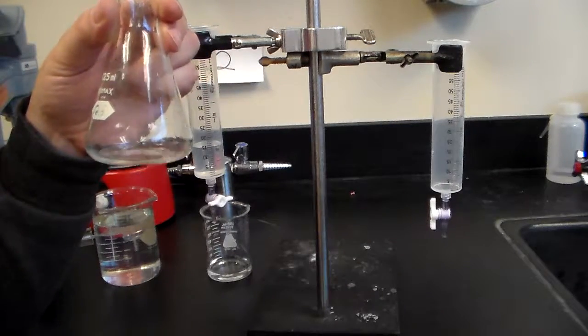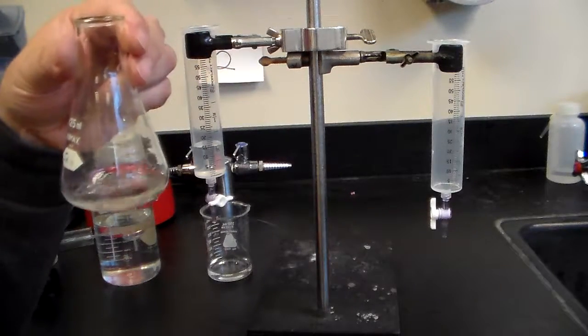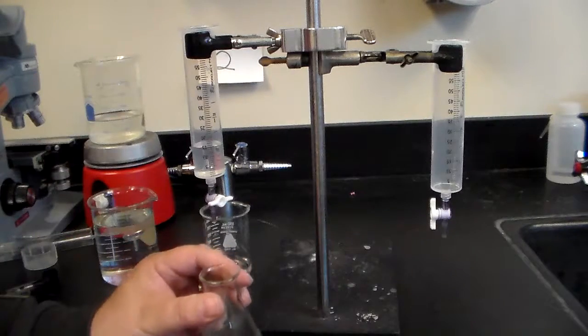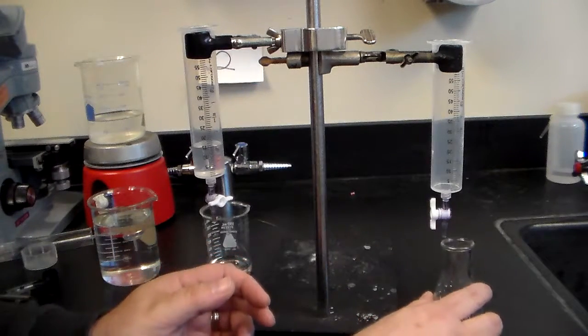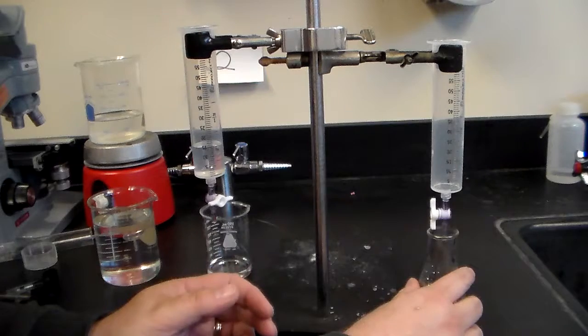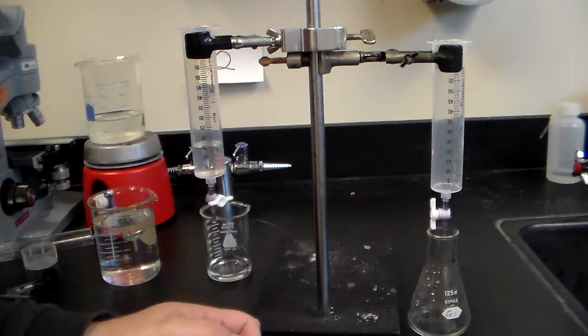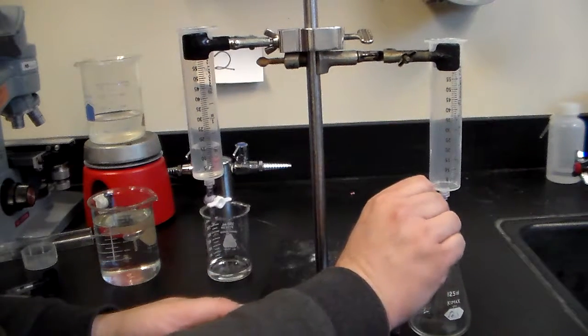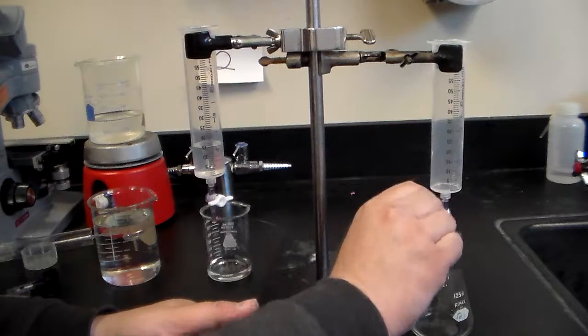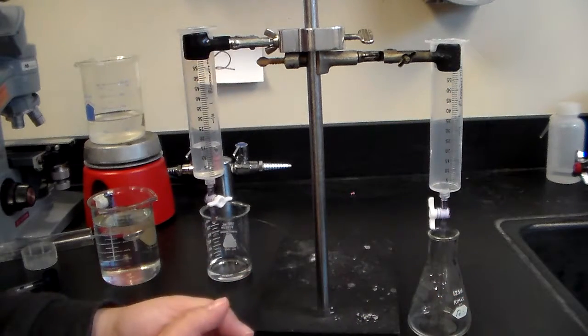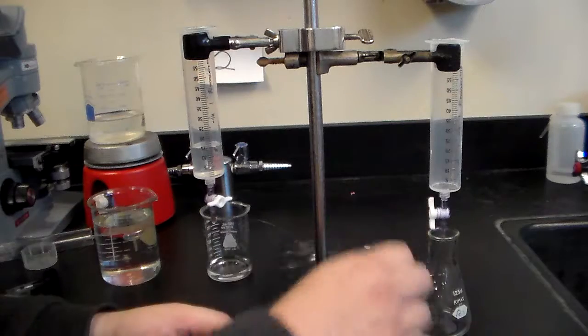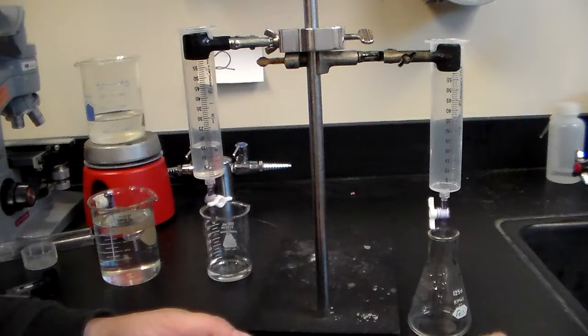Now comes the tricky part, and that's where titrating really comes in. You're going to put your flask underneath the other burette and you are going to turn this just a little bit so you're getting a drop at a time. Then you're going to have to close it and you're going to have to swirl it to get it mixed thoroughly.